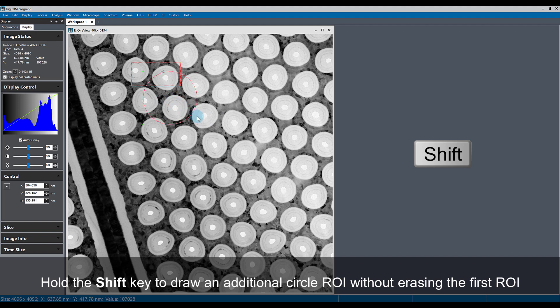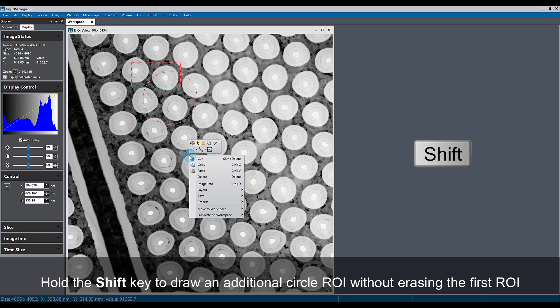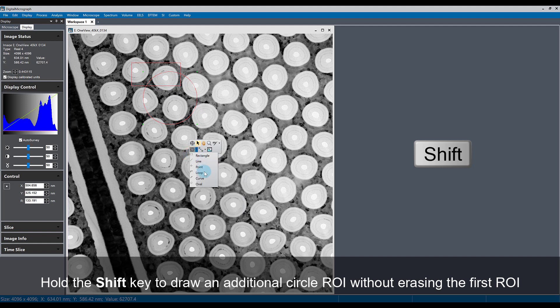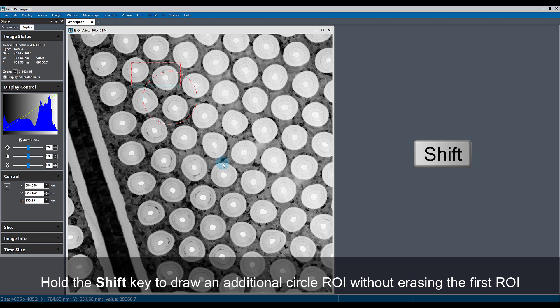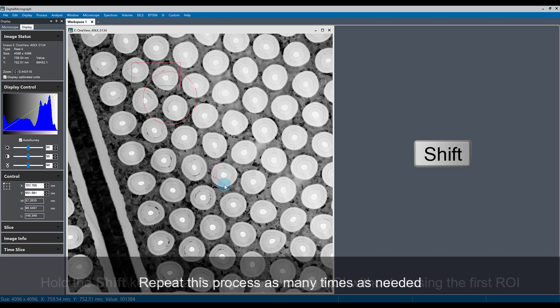I can now draw a circle ROI without erasing the original rectangle ROI, and I can go to this menu again and then draw a loop ROI this time by holding the shift key and I can have a third type of ROI.